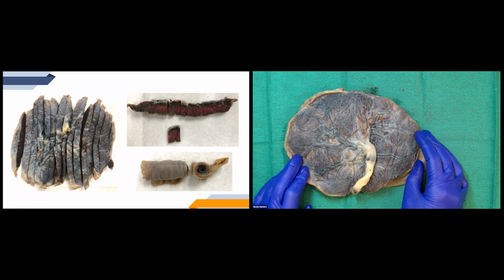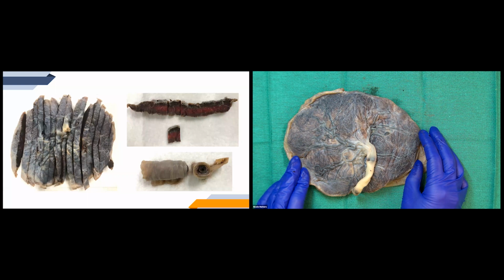Another tip for cutting membrane rolls is to make sure you have a sharp, fresh blade every time that you make a new membrane roll. That will just avoid any pulling of the tissue and will help prevent the membrane roll from all falling apart.